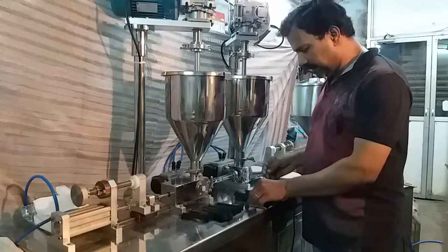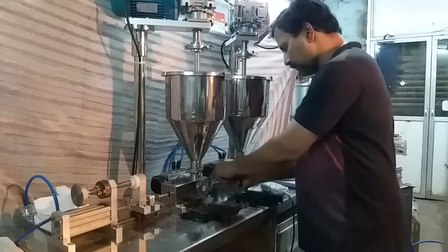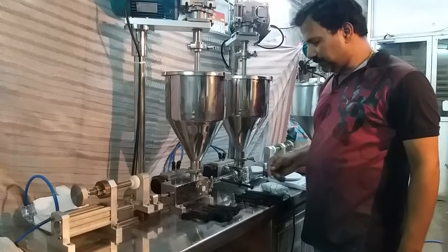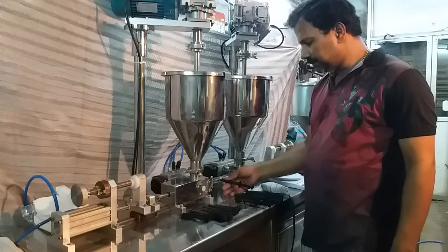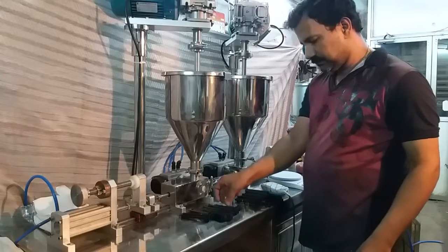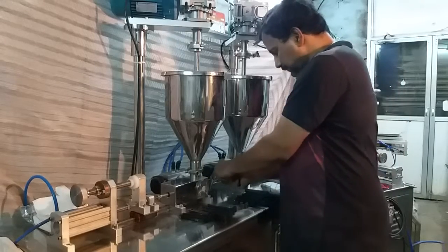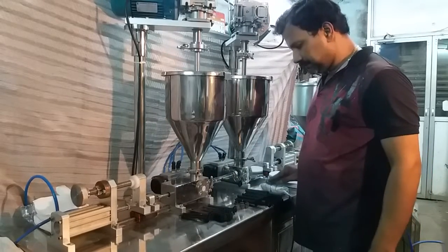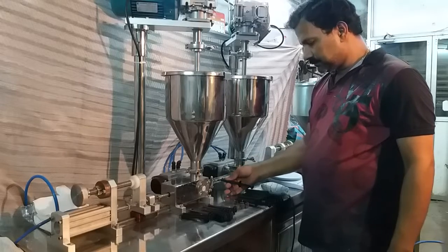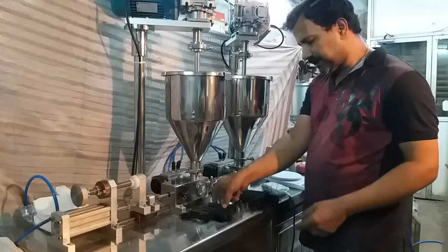Very smooth operation. We can export this machine to any part of the world. Any semi-skilled operator can operate this machine.